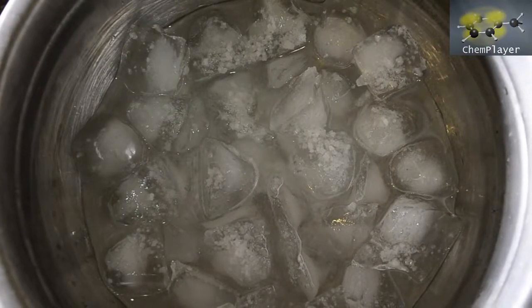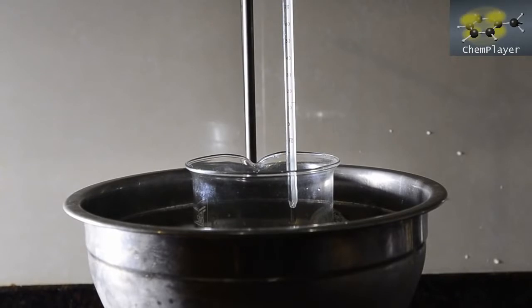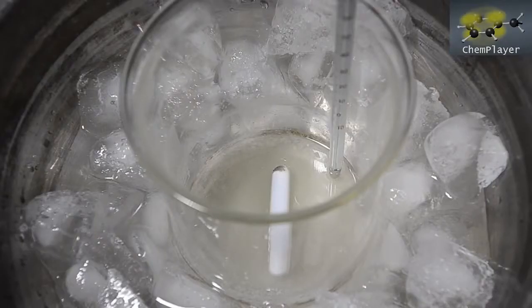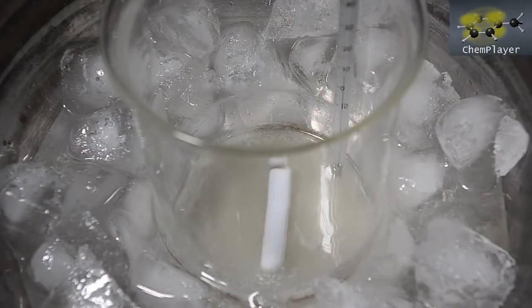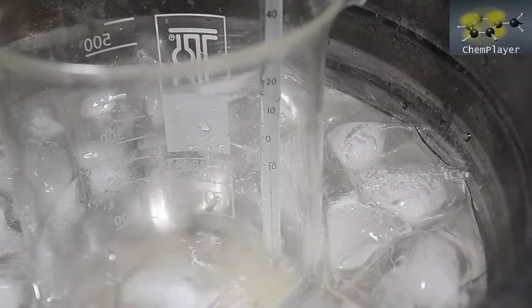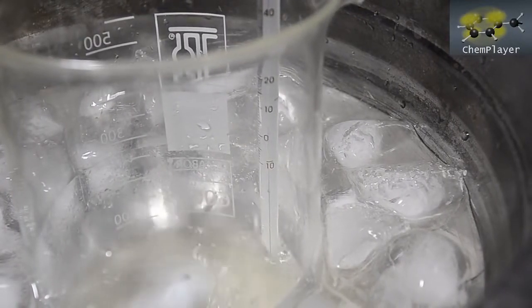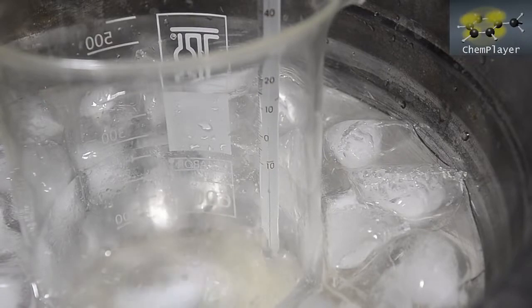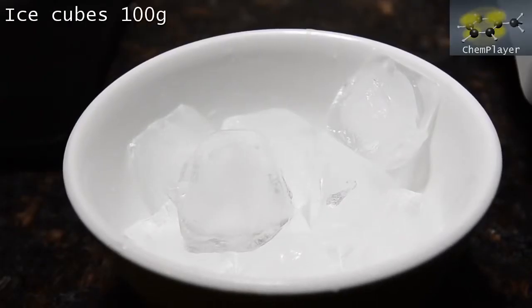Okay, so now we're ready to set up. The beaker is in the ice bath and we've the thermometer in the reaction mixture so we can carefully monitor the temperature. Let's get stirring. The temperature drops in the beaker. In order to keep it down, we're also going to use some ice cubes in the mixture. Here's 100 grams of ice cubes. Let's get these in.